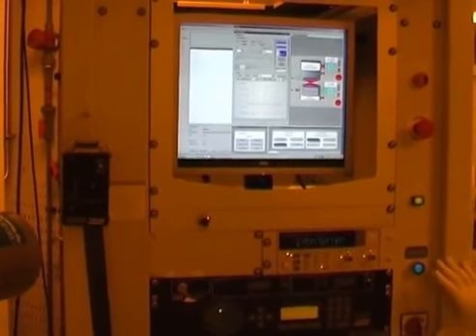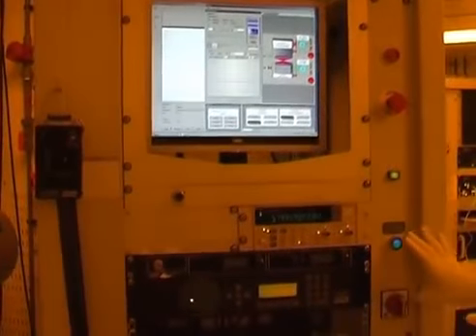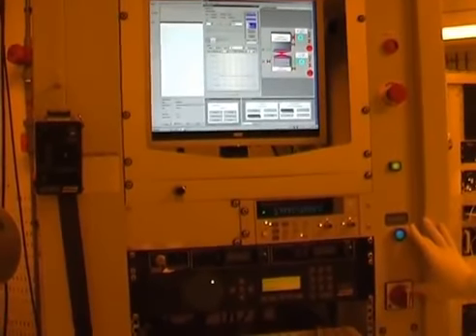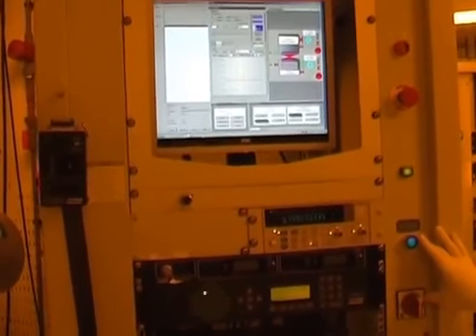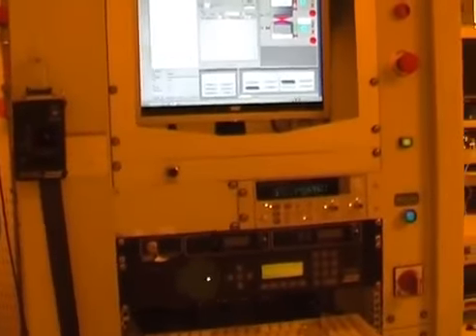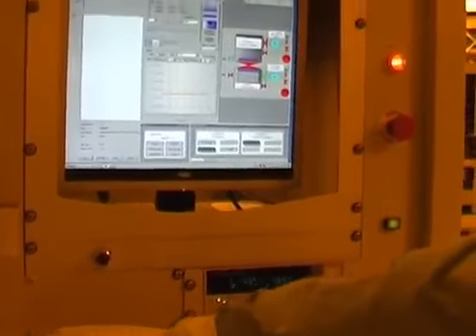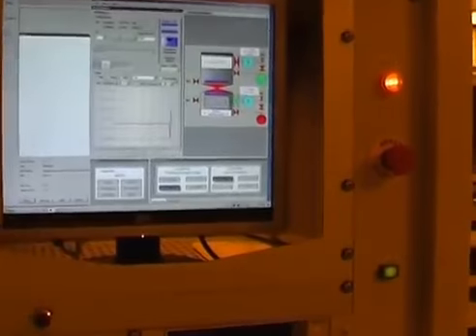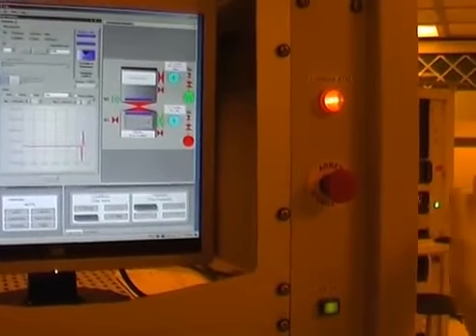These ones normally don't need to be touched other than by technical staff, because they're going to shut off and on the machine. And general users just need to make sure that the power supply is switched off, but they leave the computer and the general machine on.